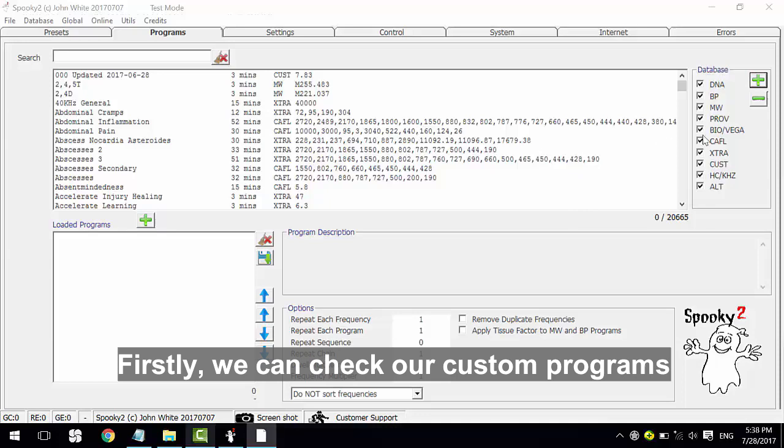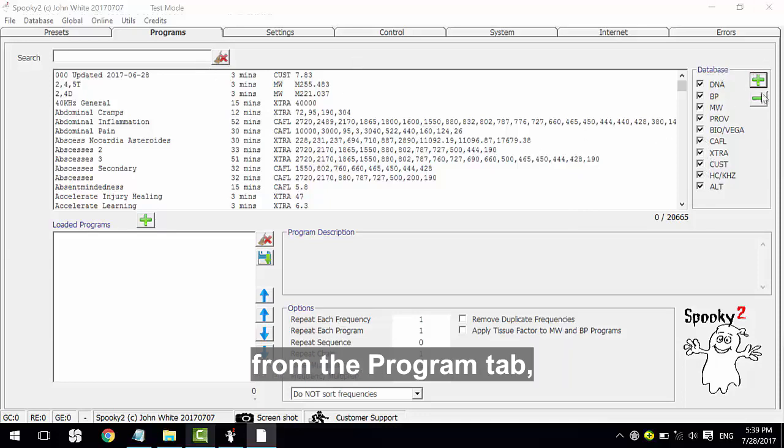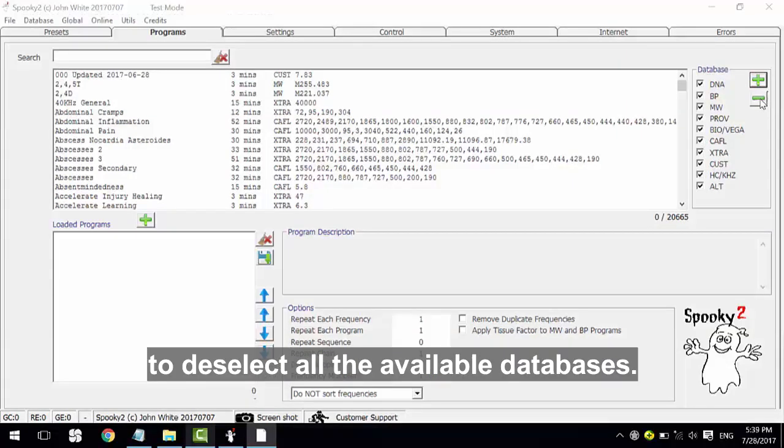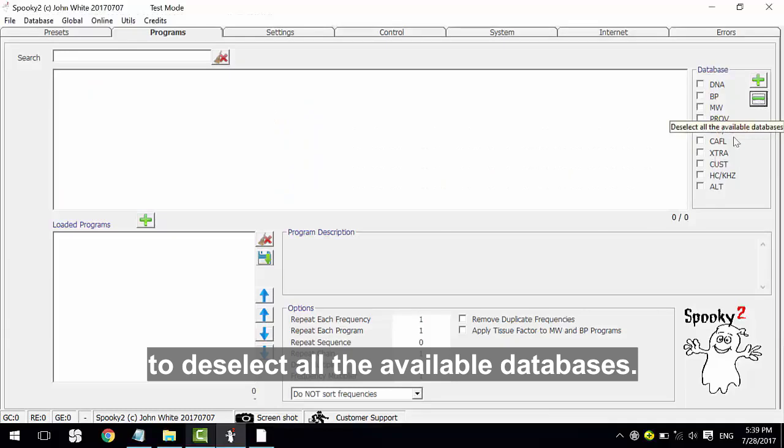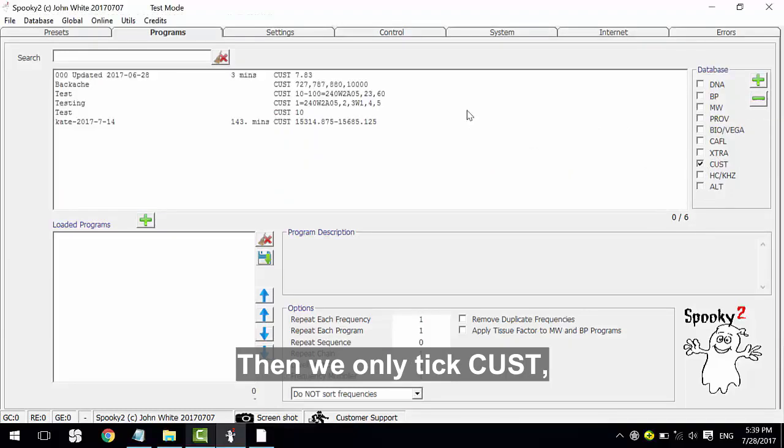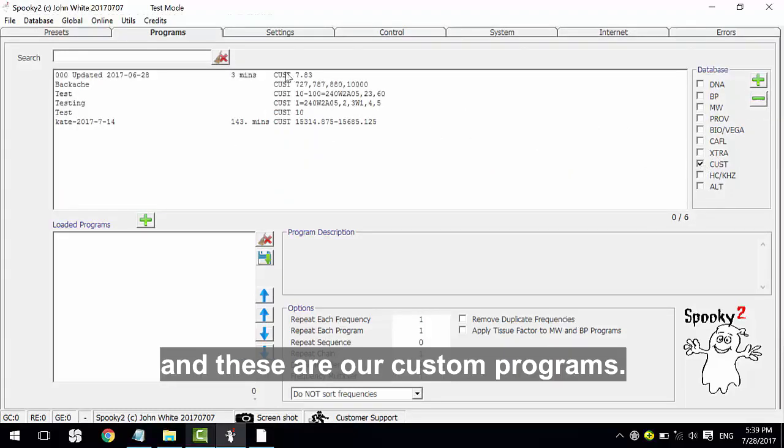First, we can check our custom programs from the custom program tab. Click this button to deselect all the available databases. Then we only tick CUST and these are our custom programs.